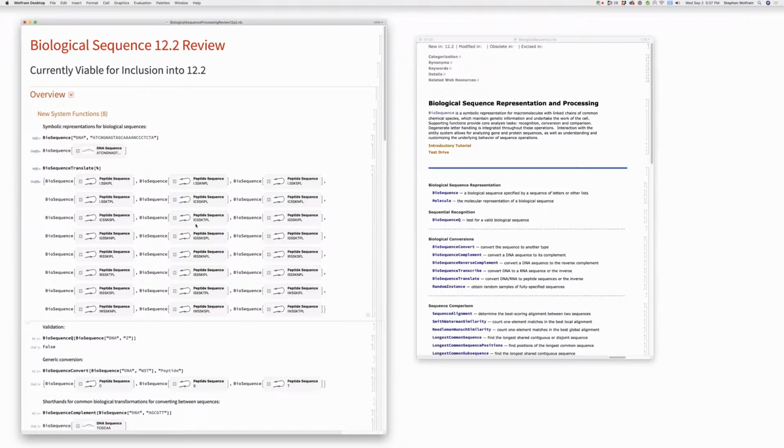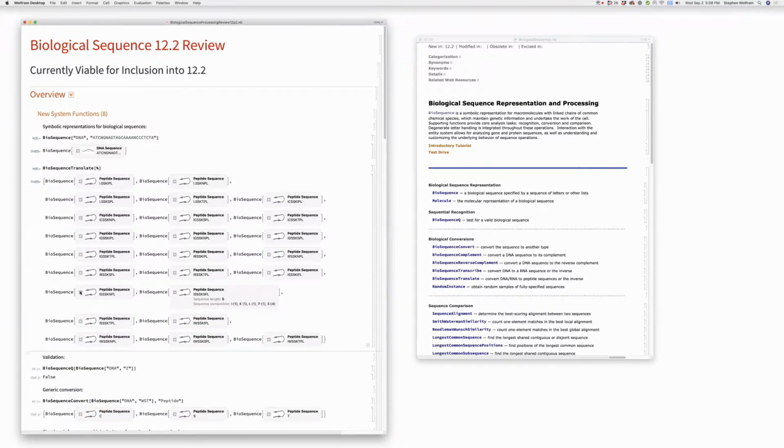So wait a minute, these are different. What does that dot mean? Dots are typically coded for the stop character. Okay, all right. So now that I've got these peptide sequences, what can I now do? You can open each of them up. You can get things like molecular weights. You could do sequence alignment with them.